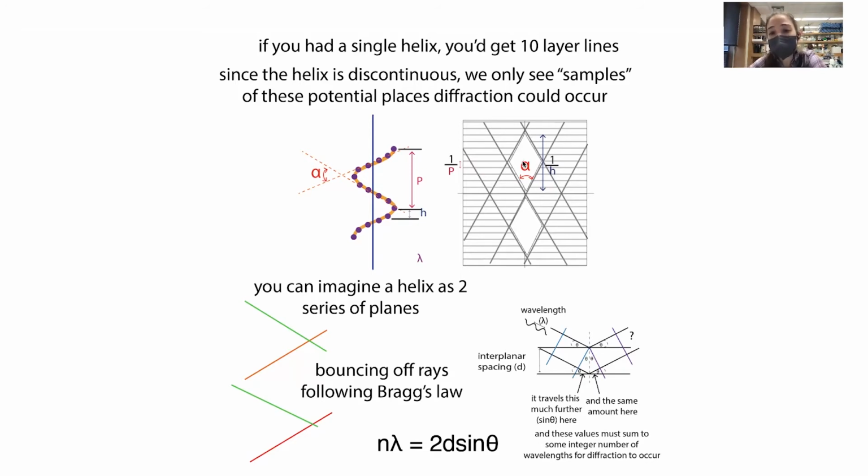But anyway, this is helping show that the phosphates were on the outside, and the phosphates are going to give us the most scattering of the X-rays, because the phosphorus atoms are bigger and have more electrons than the stuff in the center. So that will give them that information.